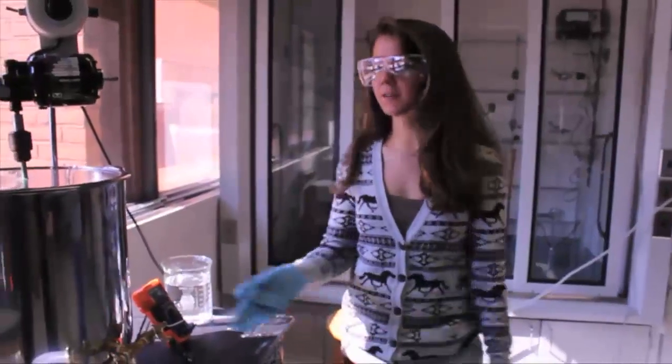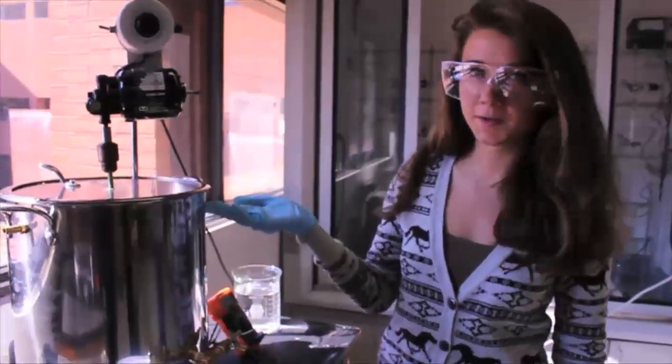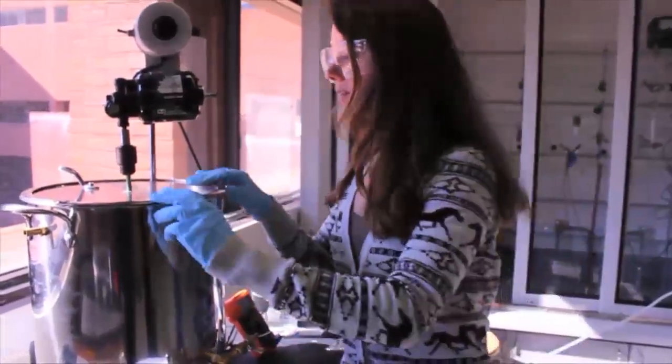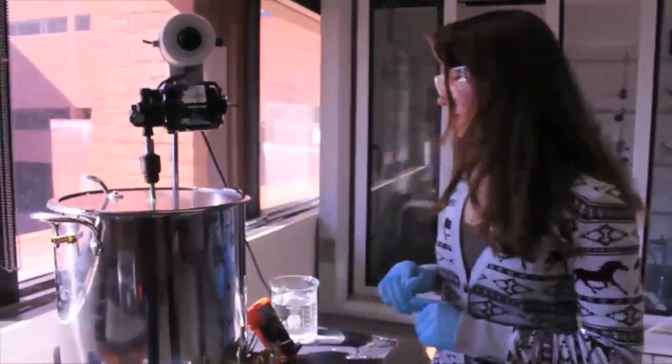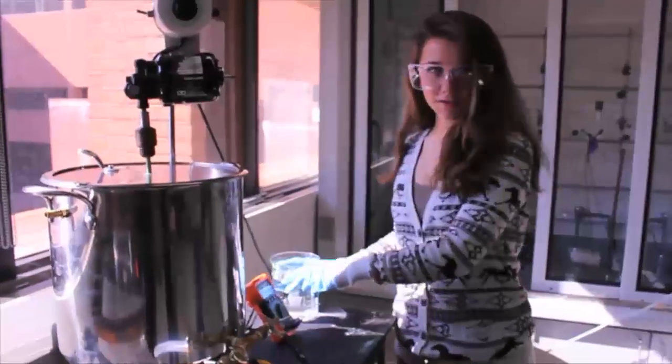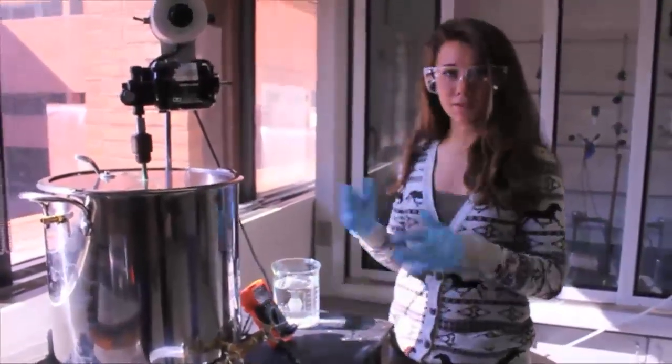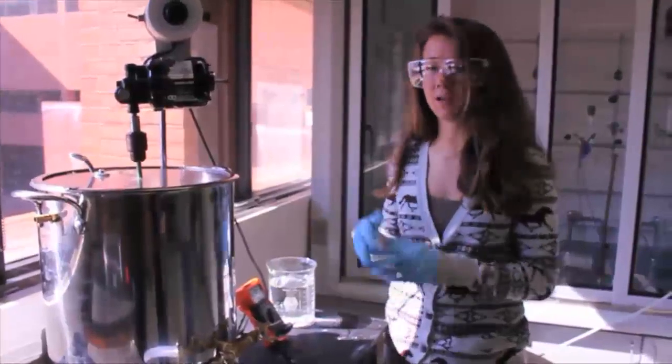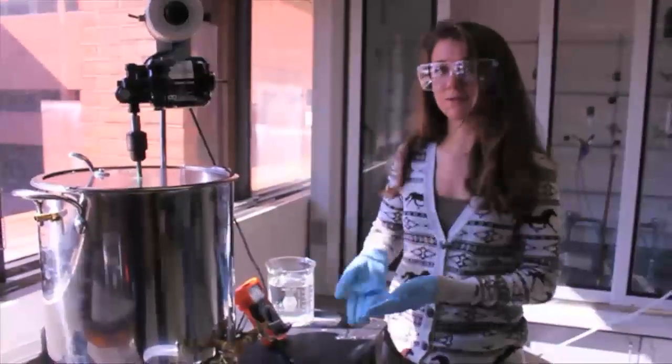So here we are with our small-scale design. This is our reactor. It's stirring at a moderate pace, and we currently have the waste vegetable oil inside. So what we're going to do is add this methanol in. We add about half at a time so that the reaction has a chance to catch up and mix properly before the methanol evaporates.